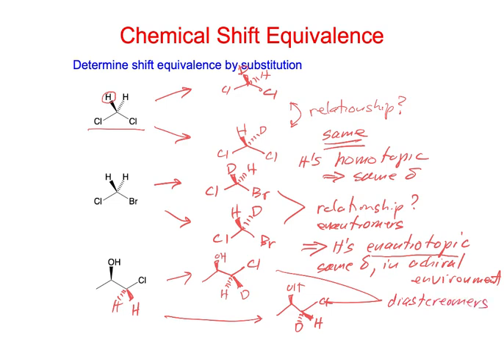So what do you think you call the protons? Diastereotopic. And what do you think? Are they going to be the same or different? Different. Diastereotopic protons are non-equivalent. So they should have different chemical shifts.